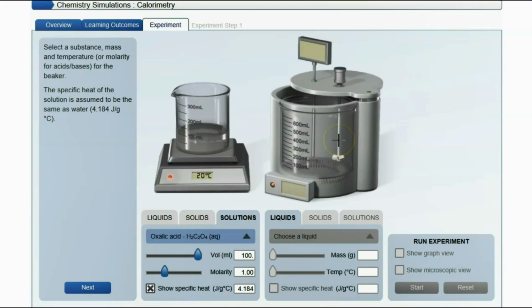A perfect calorimeter means that the apparatus will not absorb heat from the reaction or release heat to the surroundings. Simply put, the reaction that takes place in a perfect calorimeter is perfectly insulated. So in turn, we will be able to accurately determine the heat involved in the chemical process happening inside. The temperature of the solution is measured with the temperature probe here. And the solution is also stirred with a stirrer in order for the heat to be distributed evenly in the liquid.